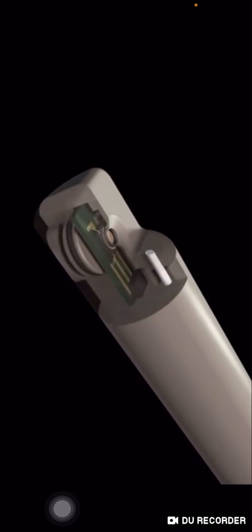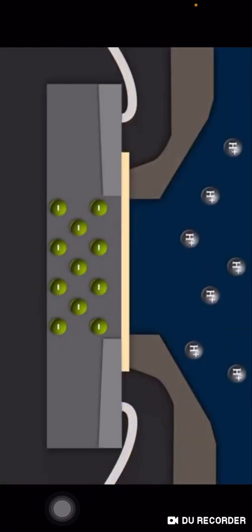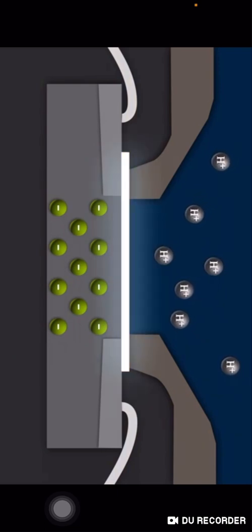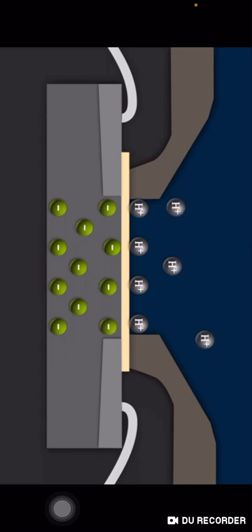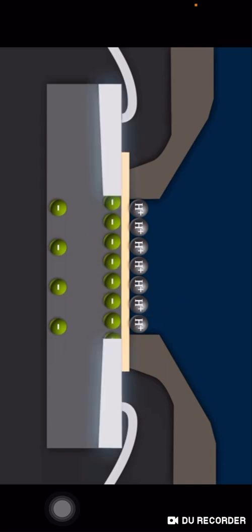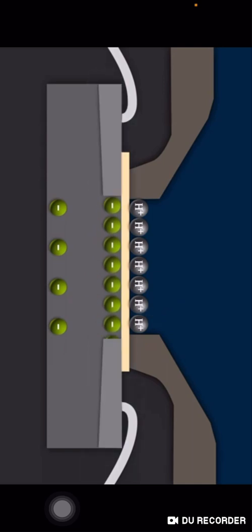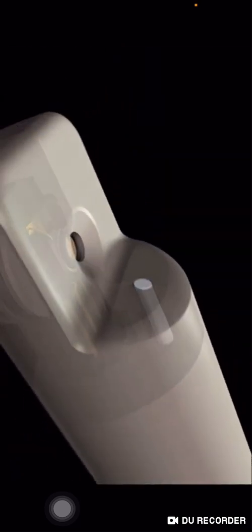pH measurement with non-glass sensors is based on so-called ion-sensitive field effect transistors, ISFET. Very important. They use a MOS transistor arrangement which consists of a pH-sensitive layer instead of a metal gate. Positive hydrogen ions forming at this layer cause the charge to be separated on the other side. As a result, the area between source and drain becomes conductive. The resulting flow of current is in direct proportion to the pH value of the medium.